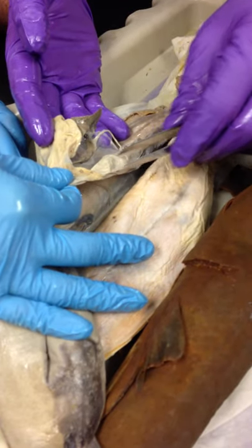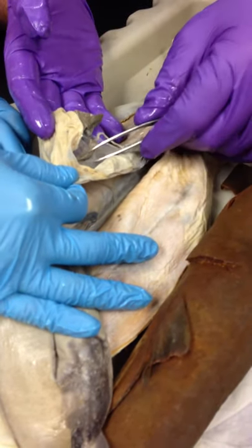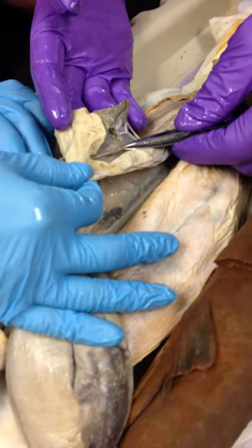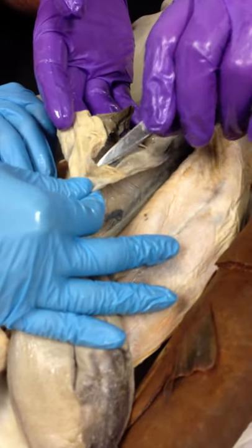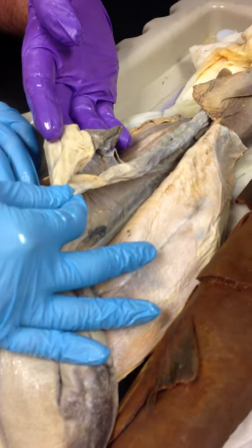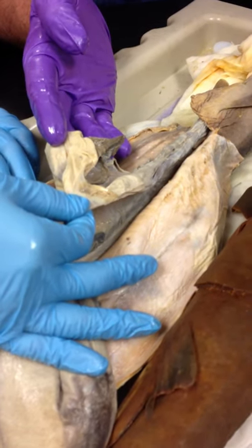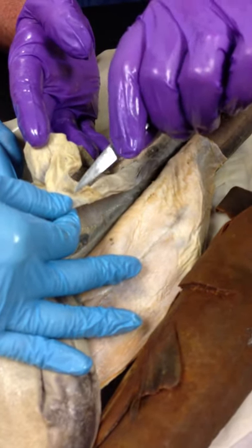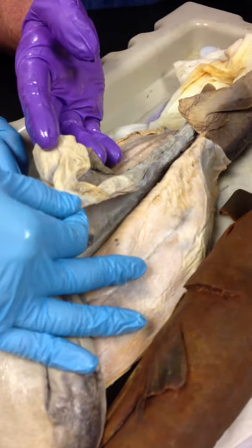If we look at the duodenum, we can see a couple of structures. One of them stuck in the mesentery right here. That's a piece of the pancreas. And then right here next to Colleen's thumb is another piece of the pancreas. So the pancreas has two parts, same organ, just not connected, different pieces of it. One scattered here, stuck on this loop of the duodenum. And the other one, ew.